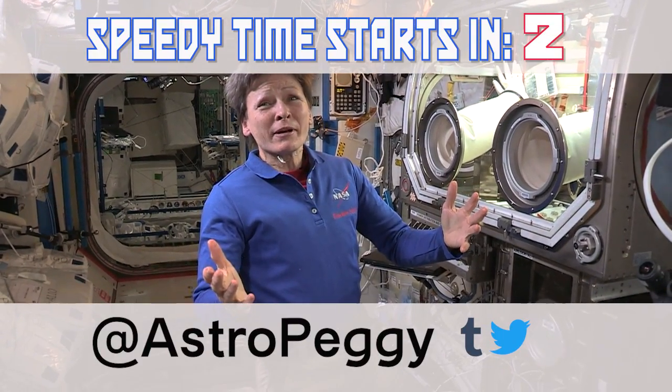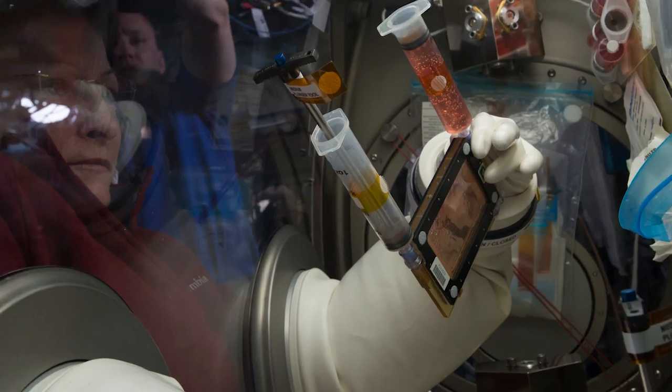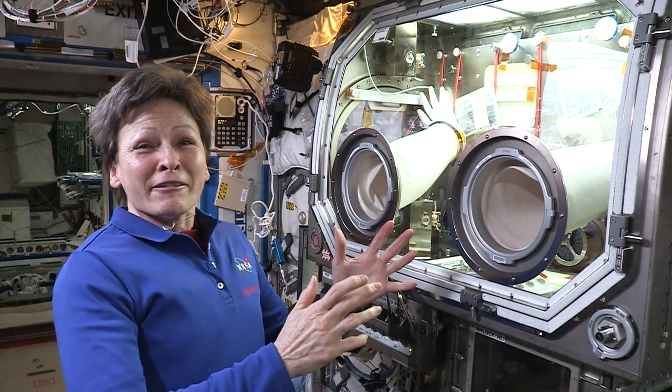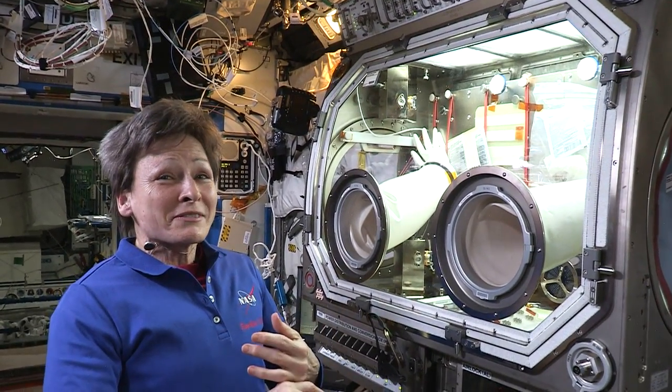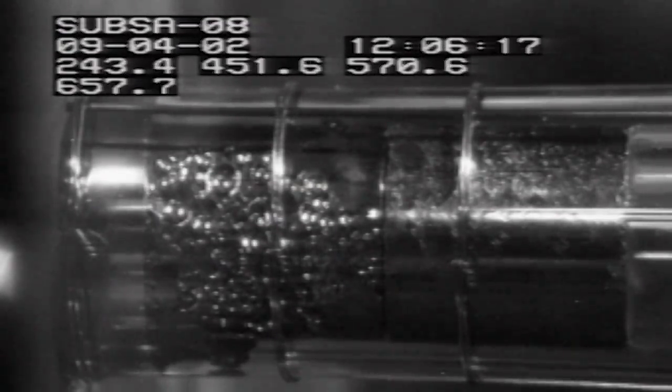Today we wanted to talk to you about the microgravity science glove box. We do all kinds of experiments in here. I've grown tissue culture cells, I've looked at how air and fluid separate, and I've grown superconductor crystals in here — they got up to over 700 degrees Fahrenheit. So this environment was designed to protect us from what was happening inside the experiment.